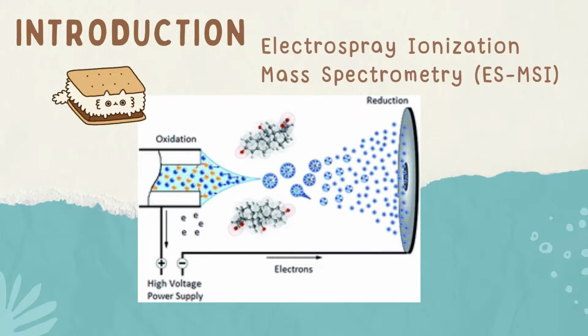For biological molecules, the methods used are softer, as the samples may be denatured using methods involving high heat. One of the most common methods used for biological samples is electrospray ionization or ESI. ESI is a non-destructive method of ionizing molecules that works by using a charged nozzle to ionize the analyte and spray them as microdroplets. As the droplets accelerate from the nozzle, the solvent evaporates, leaving only the molecule of interest along with the concentration of ions.